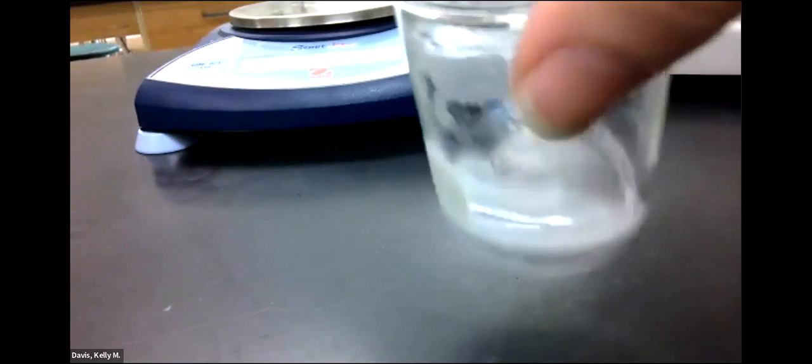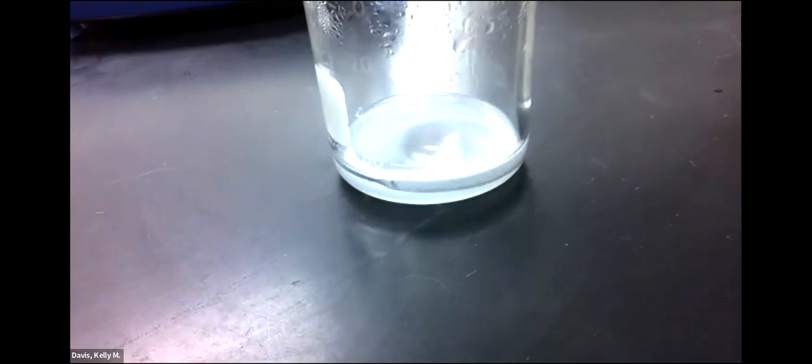All right. Still bubbling. And I don't know if you can see it because it's around the edge. It still has a little bit of magnesium in there. I can't touch it, but you can still see it. You can see it here. Yeah, see that magnesium is still there. So I'm going to add a little bit more acid. Hopefully it's almost done.